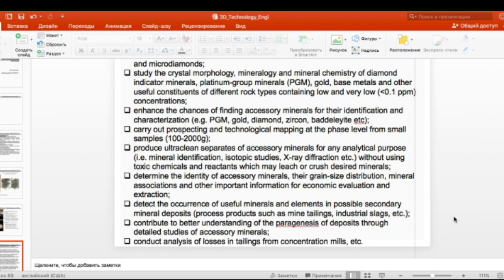So we can always find out by hydroseparation specifically, we can always find out why are the losses, in what form, what grain size. I mean, any even chemical process. There are also tailings from chemical process that we can use EPD on to extract residues of metals from scrap, for example, and then also concentrate them and understand what are the losses, why are they in the tailings.